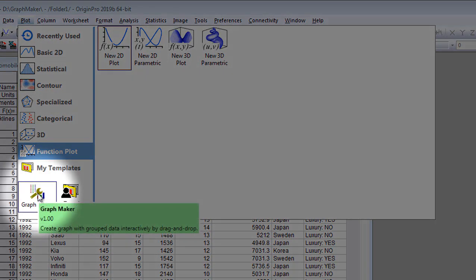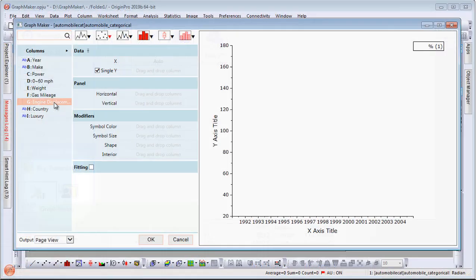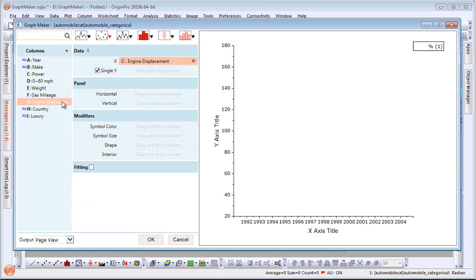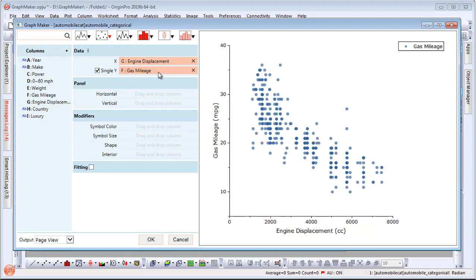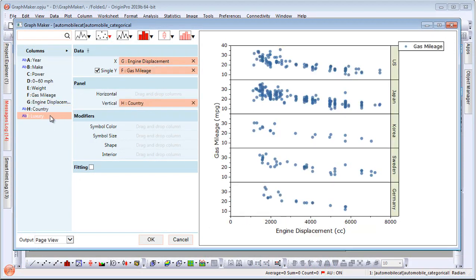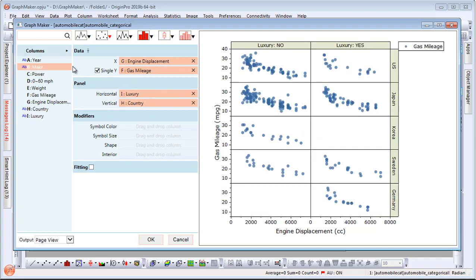The GraphMaker app allows users to simply drag and drop columns to create and customize publication quality graphs with ease.